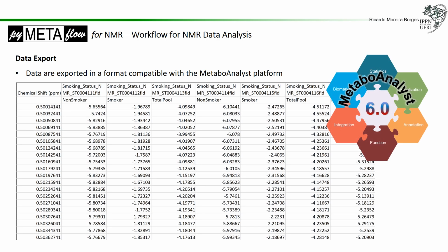And once again, you can export your data in a MetaboAnalyst format, so that you can do whatever other stuff that you want. It's just in MetaboAnalyst format because I like that format. It's actually a general data format that has the classification for each sample, right? So this is it. In the next slides, I'll be doing some demonstration with the pipeline itself.